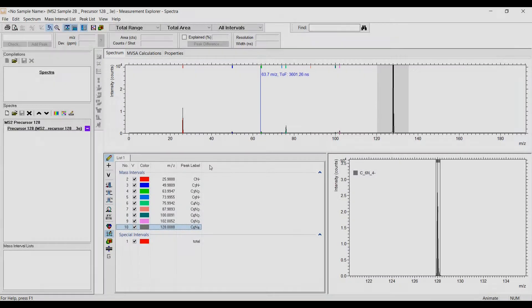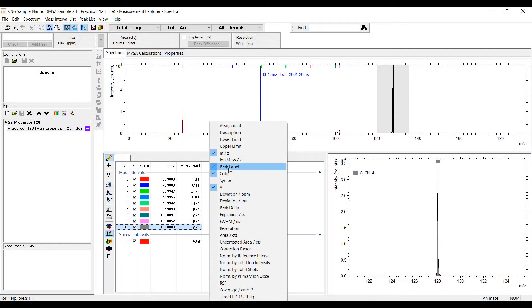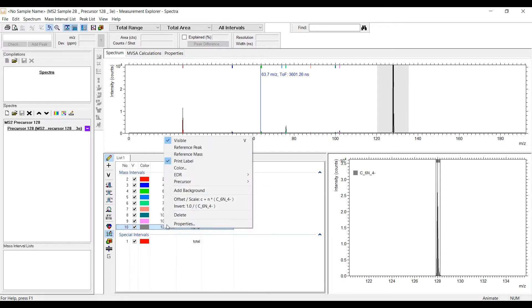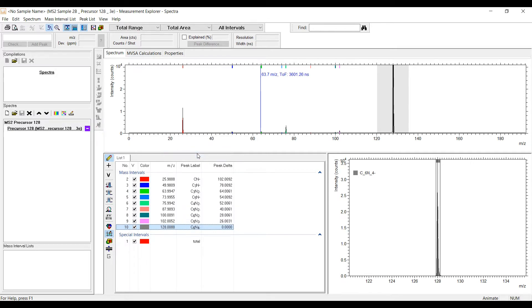A new column in the peak list shows the mass delta to a reference mass peak. The reference mass can be selected in the context menu. This feature is very helpful for data evaluation of MS2 spectra.